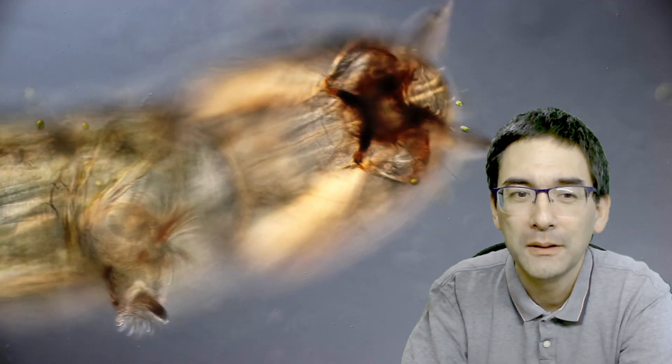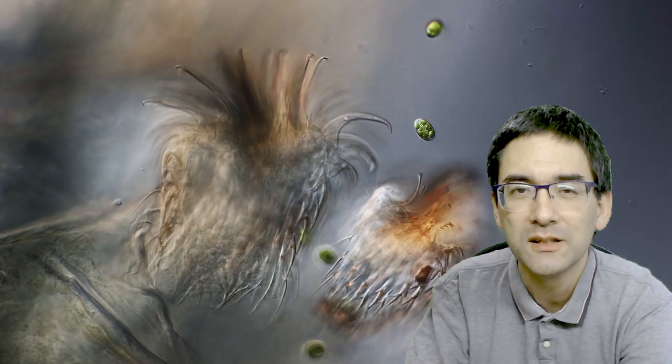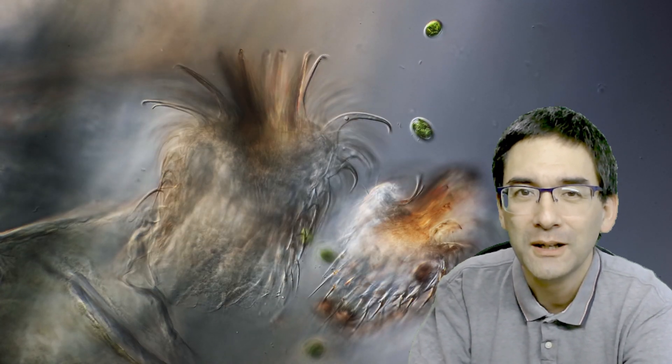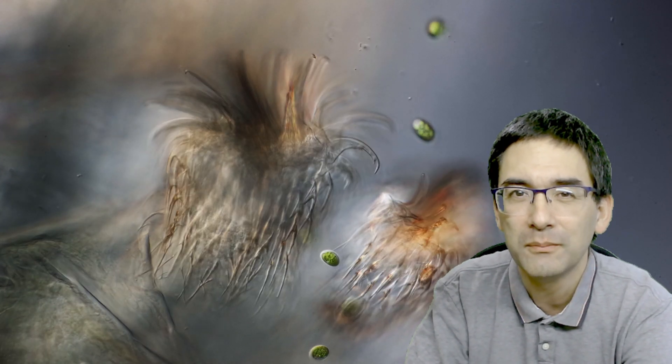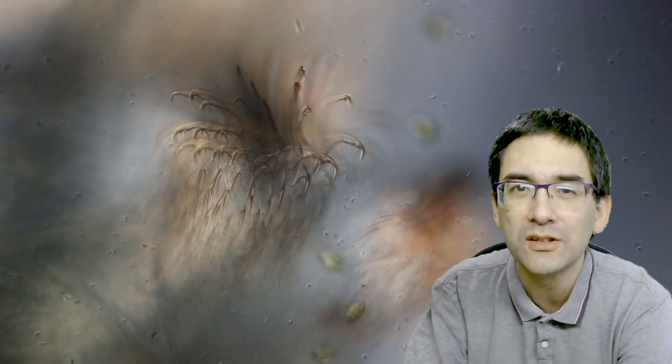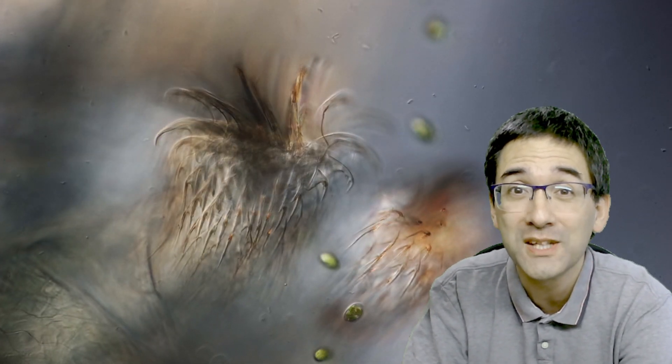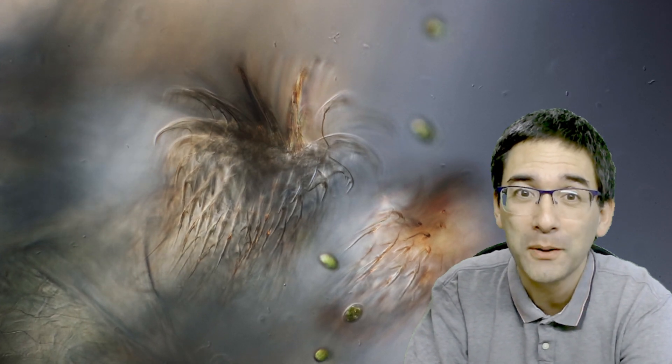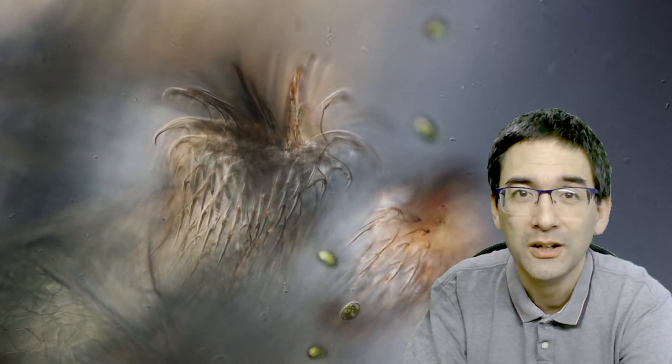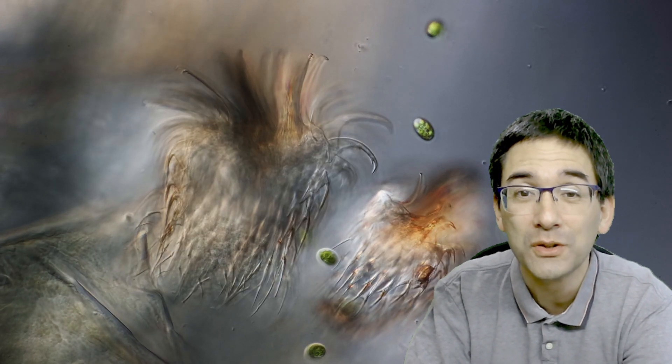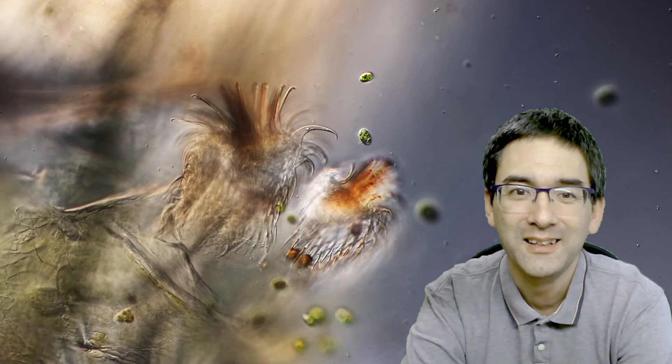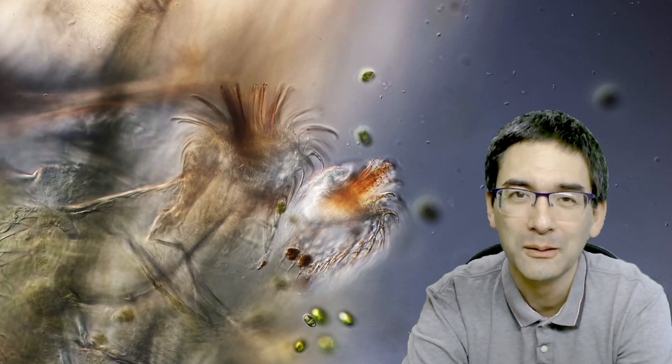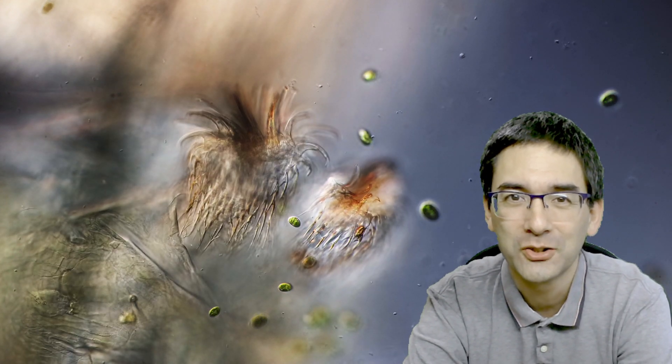I wonder what it's feeding on, but in any case, it kind of shows that if you really increase the magnification quite a bit—I think this must be using my 60 times objective—then you're really able to see quite a lot of details. Those oval things that you see in the center, those oval green structures, these are algae which were part of the water sample as well. So you can actually see a little bit of a size comparison here, that those hairs on the feet are significantly thinner than the individual cells. Quite fascinating to see. Here's yet another one over here; I need to refocus, always a little bit, otherwise I'm not able to get all layers sharp and clear.